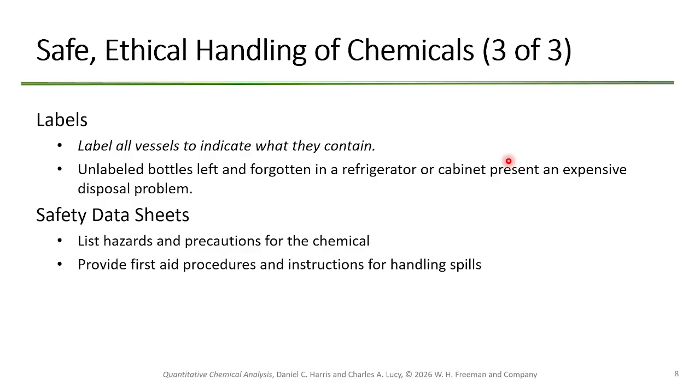Okay. You'll see that even the distilled water has the date I made it and then my initials on it. Because I end up stocking the distilled water all the time because I'm always in that lab apparently. And sometimes I don't. We have biblical floods. Like all the bottles have my name on them, you might notice. I wonder why. So, anyways, always put your name on it if you're the one that makes that label, okay?